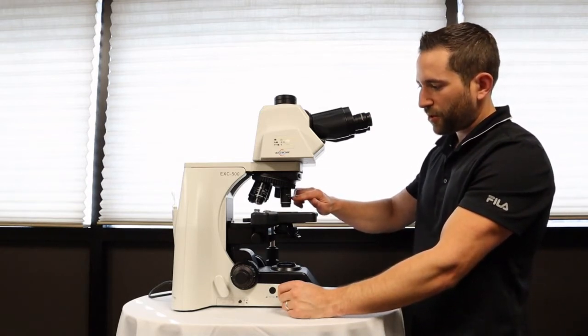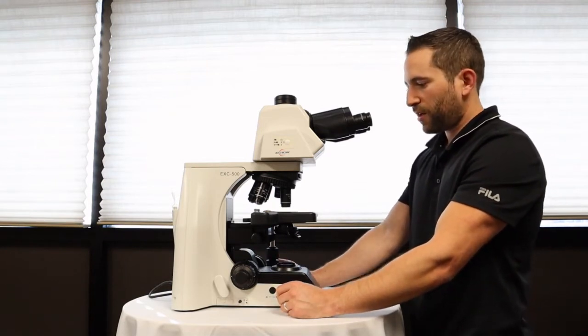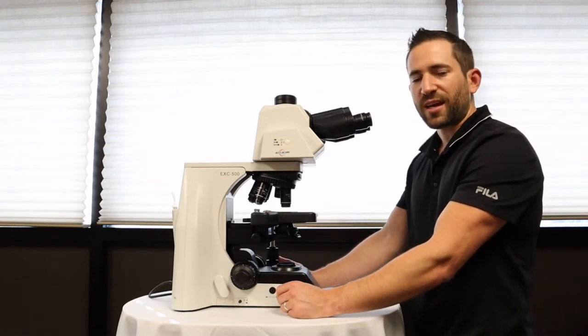A common configuration for a pathologist is 2, 4, 10, 20, sometimes 40, and sometimes 60x objectives.